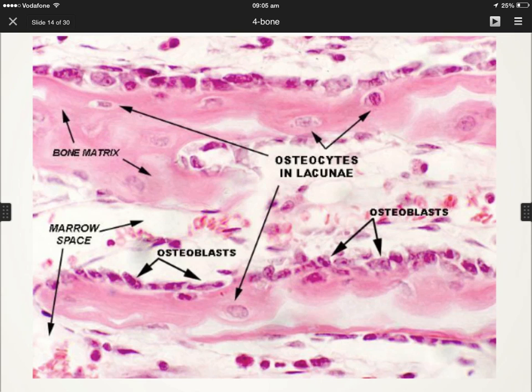After that, we have the irregular bony cavities, which are full of the different cells responsible for hemopoiesis. This is the bone marrow cavity, and you may be asked about the type of this bone marrow. It is red because it is present in the spongy bone, so it is a red or active bone marrow. So we have here osteocyte, osteoblast, bony trabeculae or bony matrix, bone marrow.